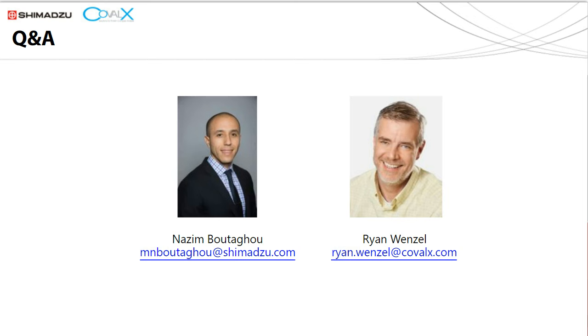But one thing of note with those instruments is that they often need to assume the stoichiometry, the ratio of the interaction. And that is something that the OmegaTOF and some of the examples I showed can be useful for. So while it doesn't measure binding kinetics, it is somewhat orthogonal and does contribute in some ways to those measurements. So good question.